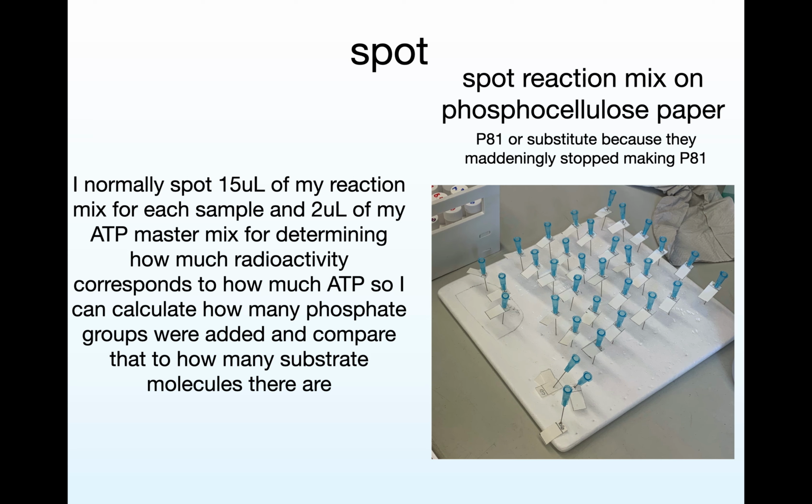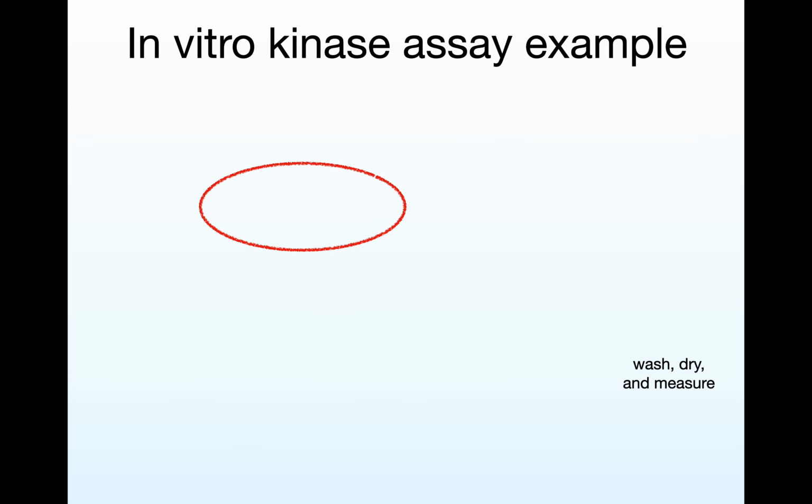So yeah, you want to make sure also that your filter paper is at the top of the sticky thing and not actually touching. And I like to line them up, so I do my experiments in strip tubes, and so I just line them up how the strip tubes go, and that sort of thing. And of course this will all be done behind a plexiglass shield in the hot room with safety and scanning and all that stuff.